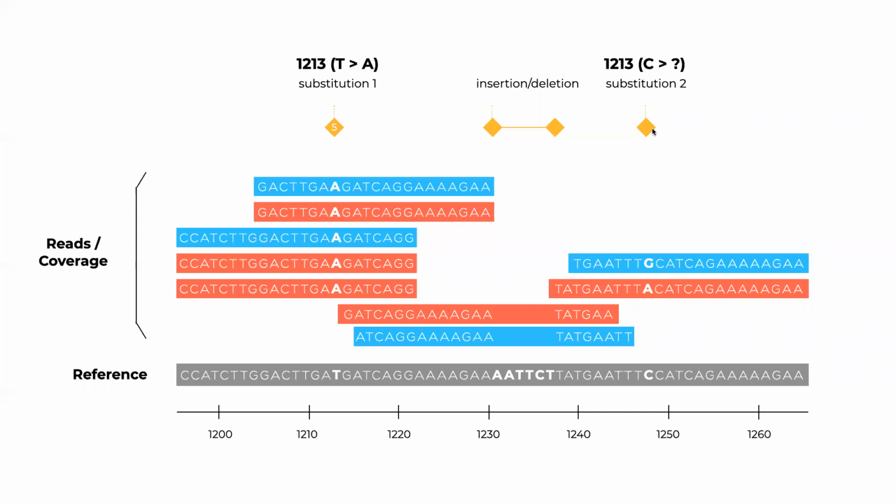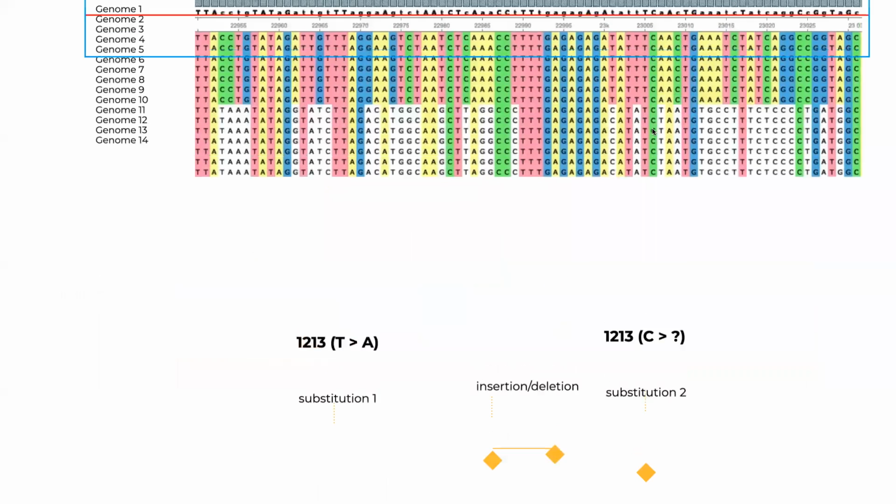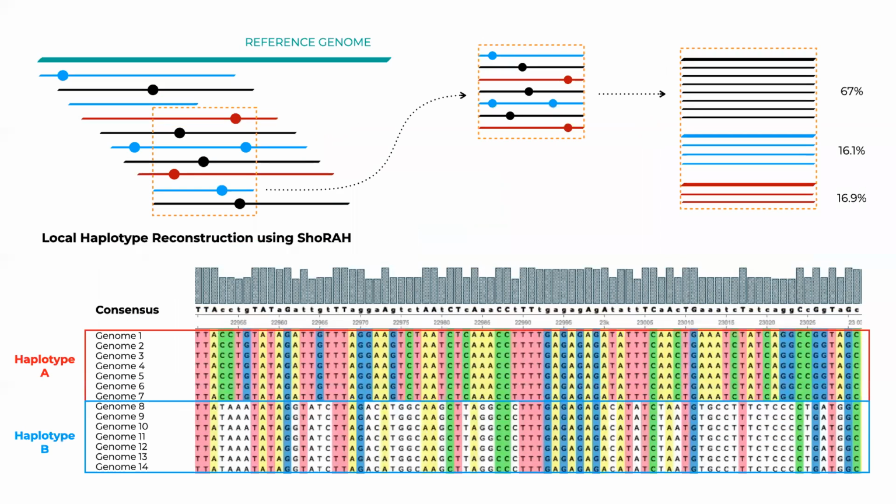So as a result, we can start looking at a number of things inside a FASTQ file. We'll talk about this more next time, but one of the options is to look at different consensus sequences present inside a FASTQ file. For example, here we see how different positions mutating on the genome represent different similar sequences inside a FASTQ file.